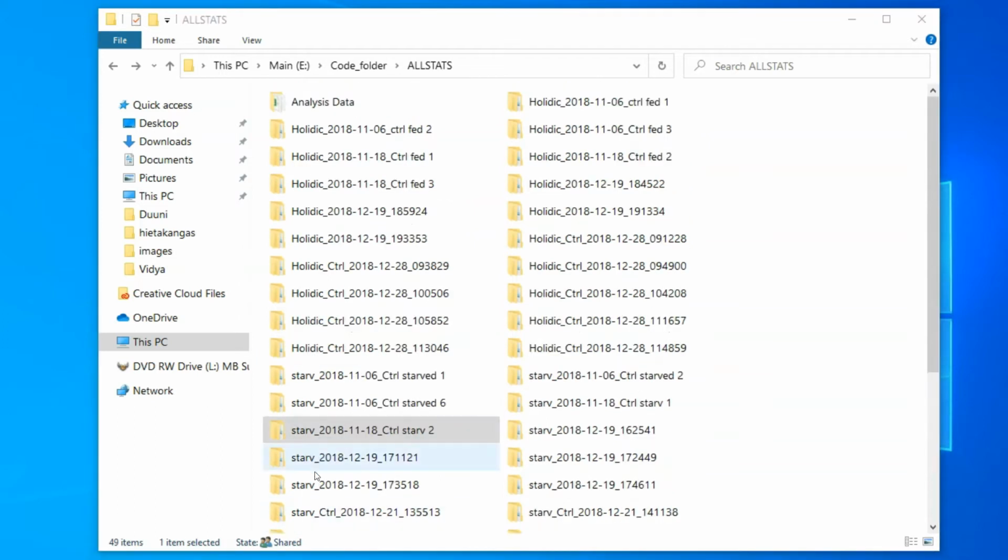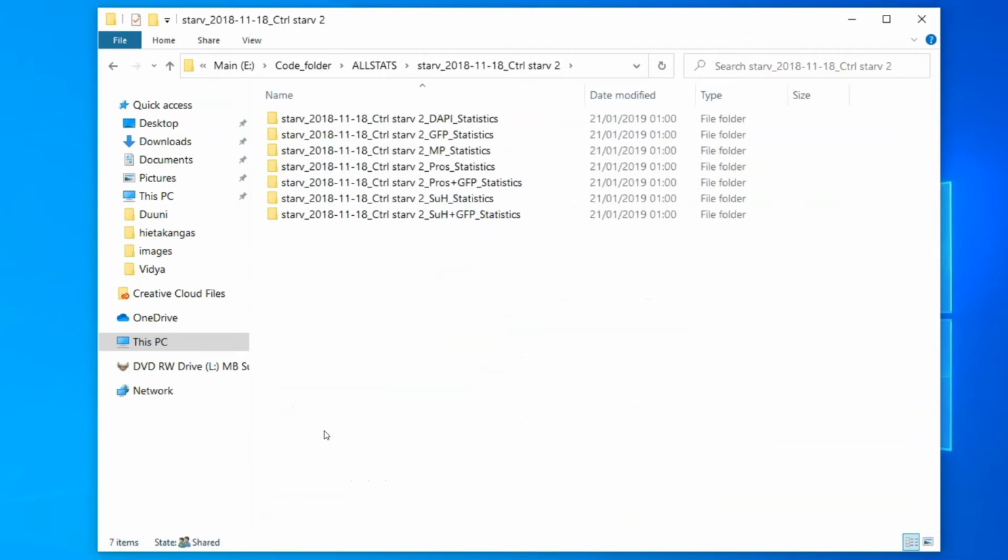Within each sample folder, different object sets are placed in separate folders. These should be named with the sample group and sample name as before, but extended with object set's name and the text of your choice, both separated by underscores. These dataset folders are called channels, named after microscopy channels, but can contain, for example, datasets of co-localized objects.